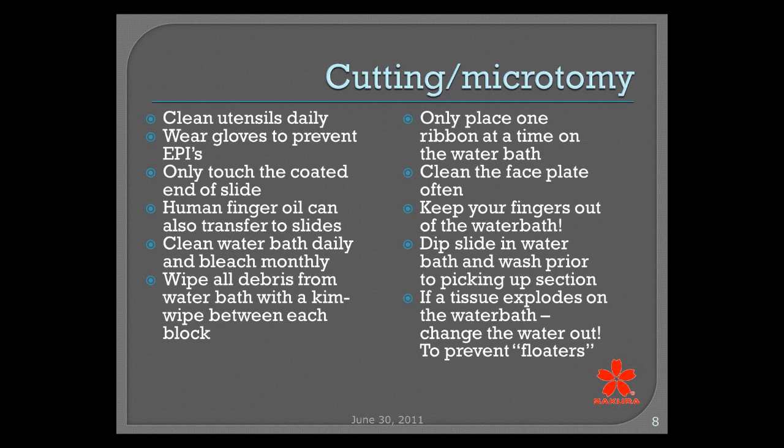EPIs, back to EPIs, keep your fingers out of the water bath. If you're not cutting with gloves on and you're constantly sticking your fingers in the water bath, then you're going to get free-floating EPIs in your water bath and you're going to pick them up on your slide.